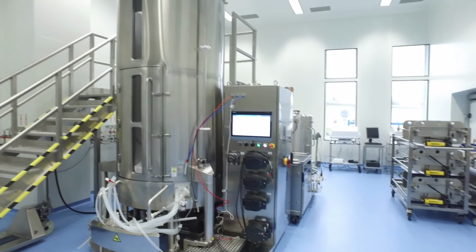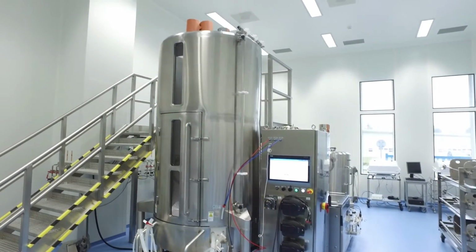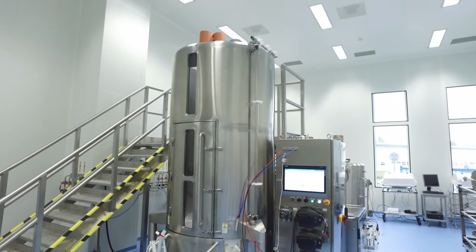We can use a number of options to reduce HCPs, such as mixed mode or hydrophobic interactions columns. For this project, these approaches were too complex and would not allow us to deliver an optimized solution within the compressed time frame. These options will also not solve the problem of clarification filter filtrability of the 2,000 liter. A reduction in bioreactor size to 1,000 liter, which will allow for clarification, was not an option due to the amount of drug substance needed for the trial.